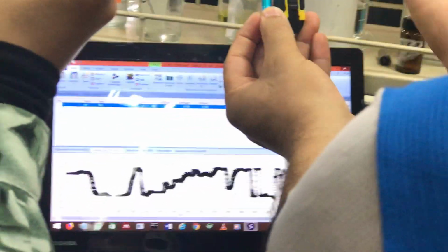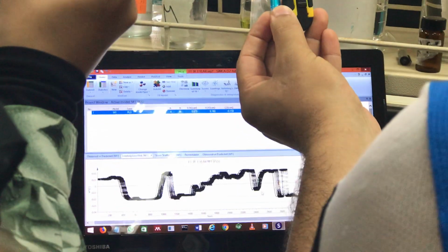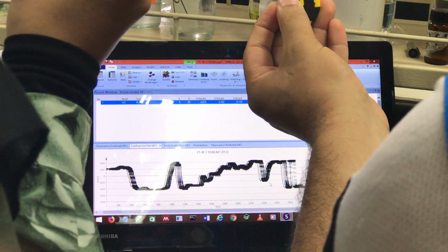I will tell her, okay. Another brother, come. Give me the other 40%. Meaning the total is coming to 100% difference. That means there are 3 components.